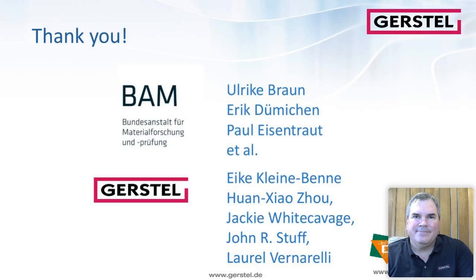Thank you, Kurt, for your nice presentation. I see we have one question from Thomas Lucius. A bit of a sidetrack, but from my understanding, currently data from pyrolysis is difficult to get quantified within, for example, an internal standard on GC, an IS that goes through the full injection system.